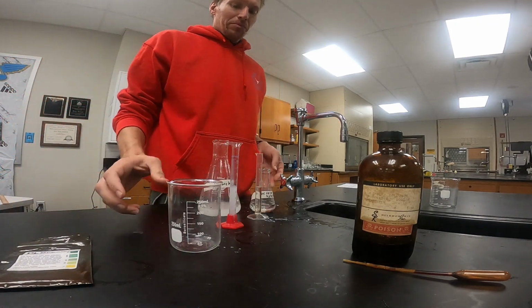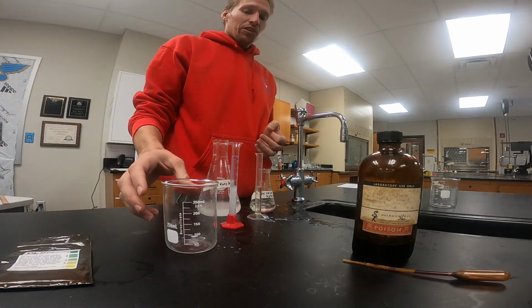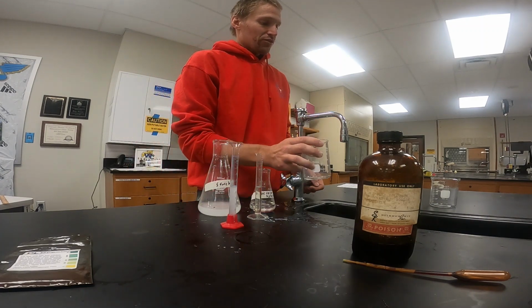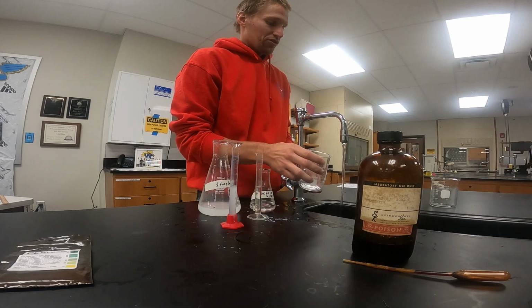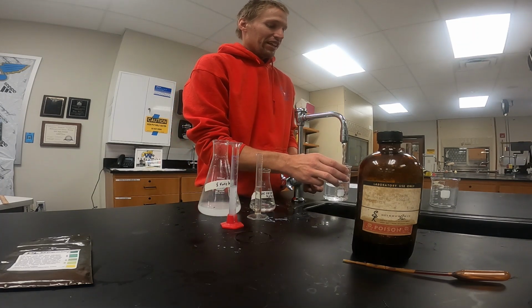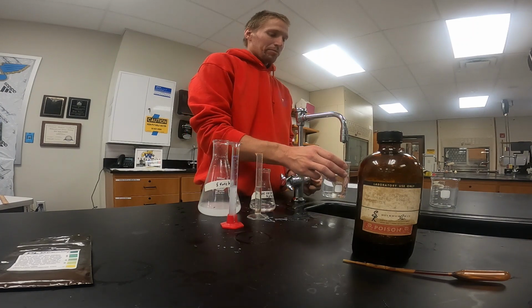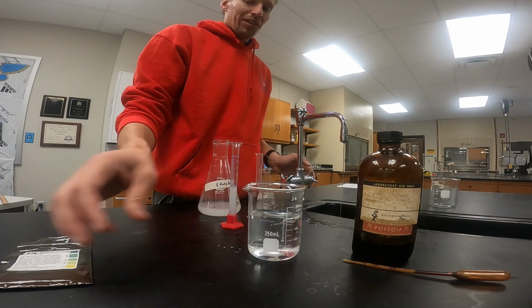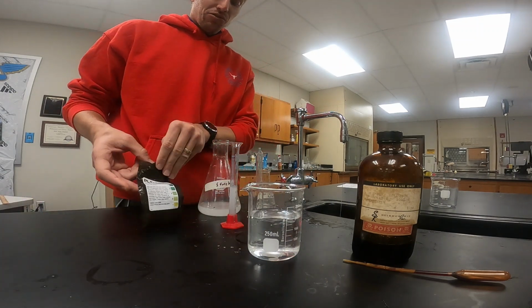For the next part of this experiment, we're going to start by taking a 250 milliliter beaker. In this case, we're just going to use tap water. You could also use distilled water. And we're going to put approximately 200 milliliters in. It doesn't have to be exact. And then the first thing we're going to do with that is a glucose test.